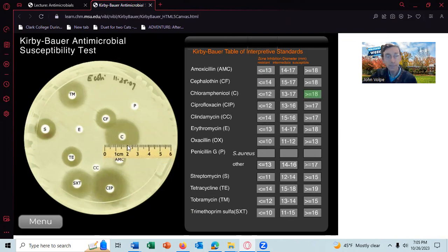For CF, we'll do that one here. And it looks like that's about 17 for CF. I'm going to take the wrong one. So it's actually here. I'm going to take green, 18. Oops. Let me redo that one. Now that I've done that, I see it is 18. All right, let's go and take another one.